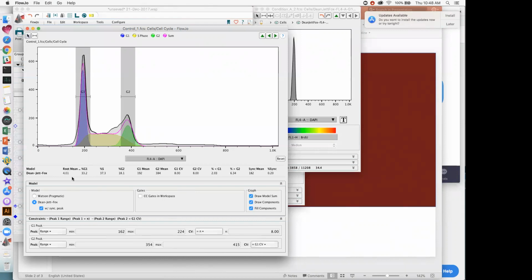But as we saw when I played around with this CV a little bit, the better value was slightly smaller. So when we had this as a narrower CV here, we set this to 7. If I click off of this, that RMS goes down to 3.9. Okay, so you could say technically it's better to leave that as a little narrower of a histogram, because the model actually has a better fit here when I reduce it to 7.